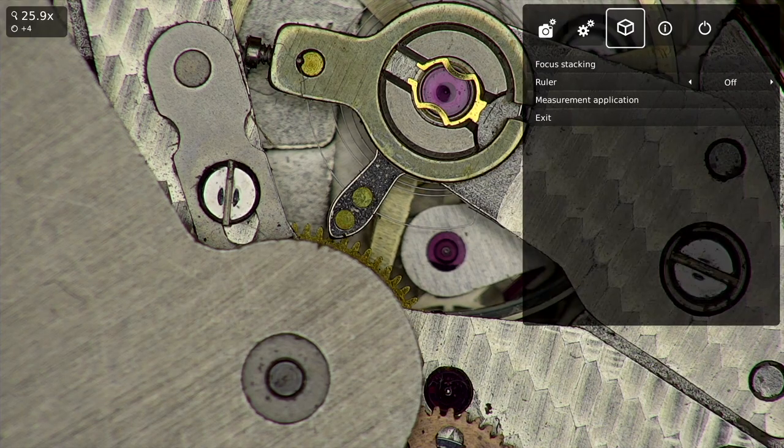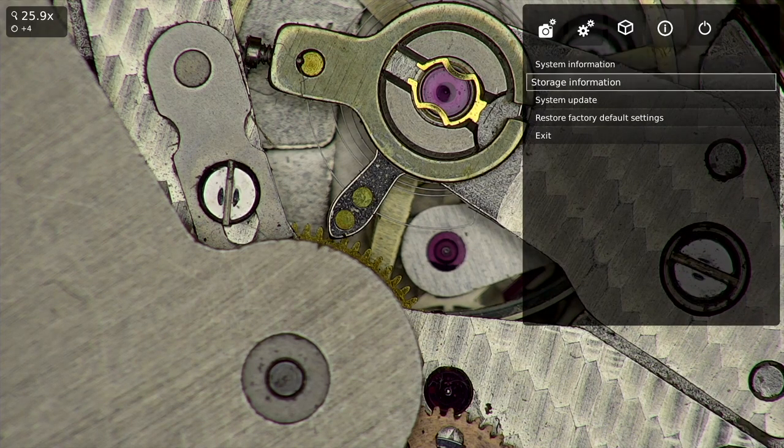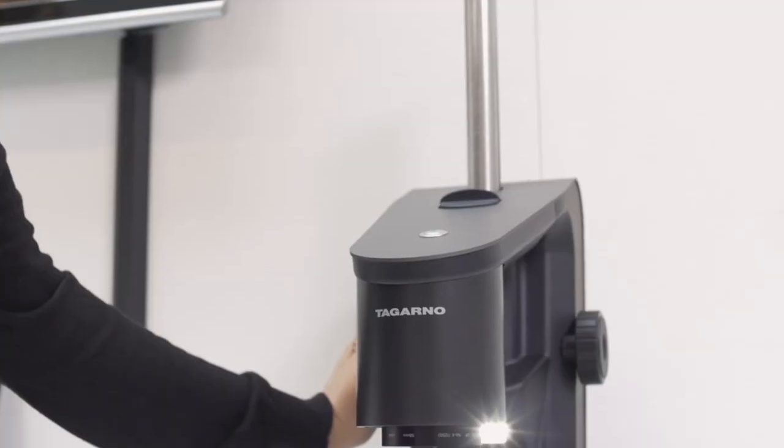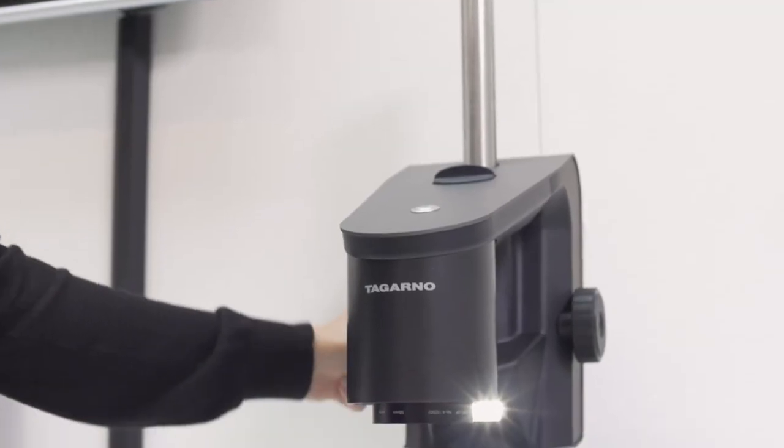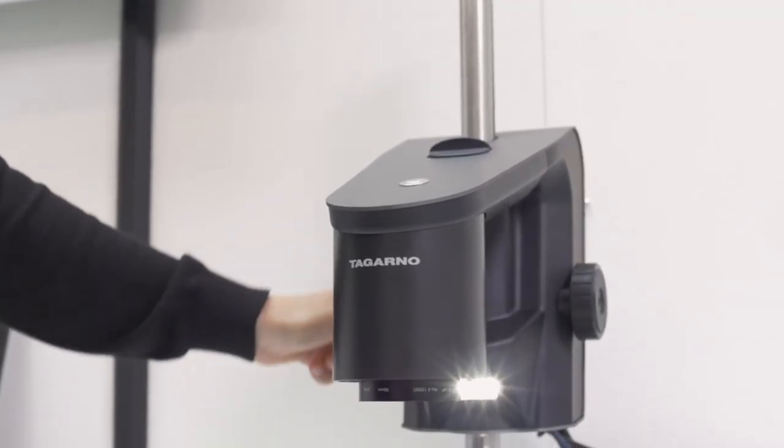With this avant-garde and intelligent digital microscope, I am able to easily update and adjust the system to fit perfectly with my needs.